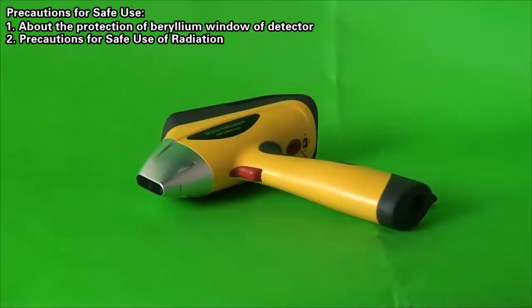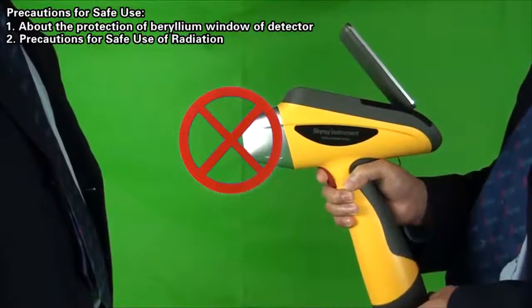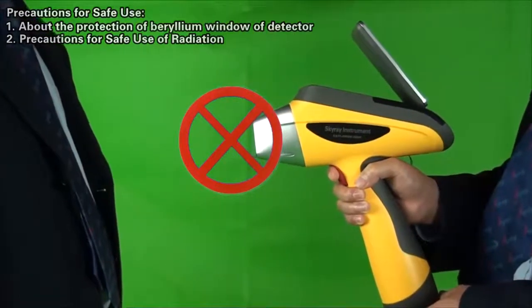Precautions for Safe Use of Radiation: In test, never target the device at others in order to prevent any radioactive injury to them.